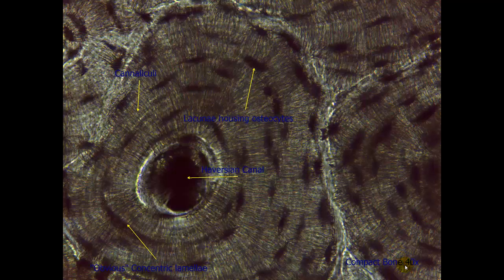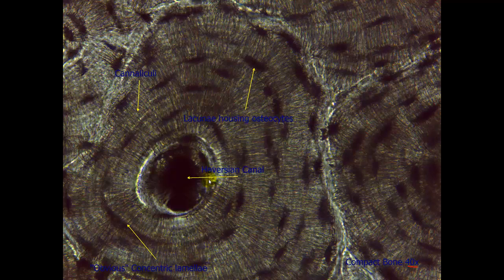Here is a 40x magnification of that same slide. Here is our haversion canal. Here is our lacunae. These are the black spots. We also have these rings that go around in circles. That gives it that bullseye look. Those are called concentric lamellae. And then we also have these little lines that are going in this direction. Those are actual spaces that we call canaliculi. These concentric lamellae and canaliculi allow the cells to exchange materials through the fluid that passes in these spaces.